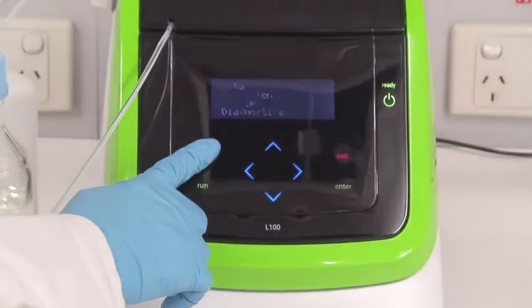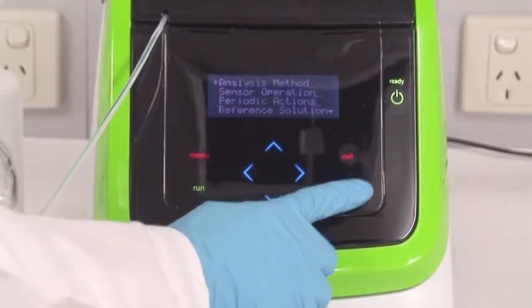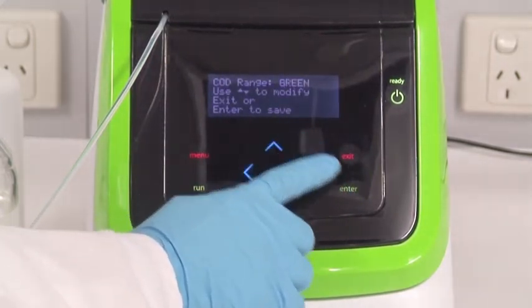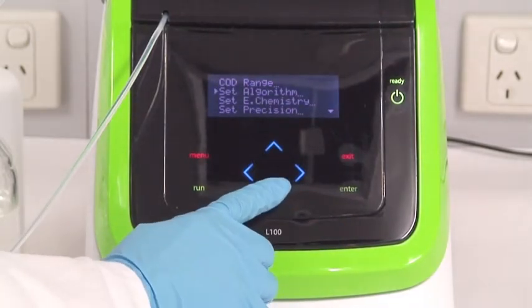Now select the COD range. Then select Rapid or Precise mode.